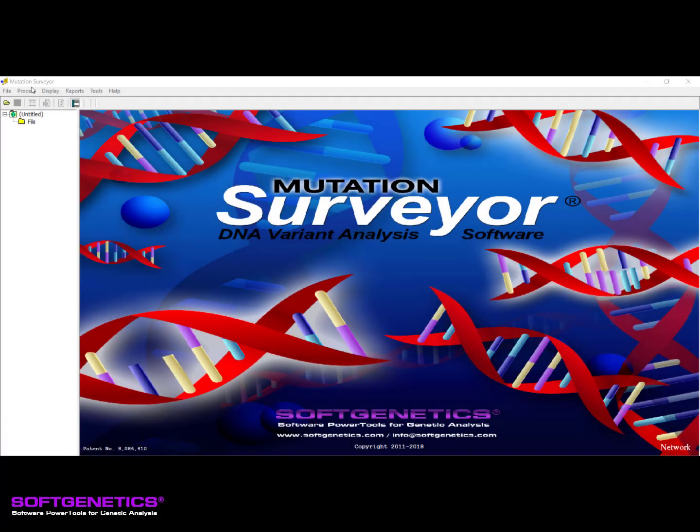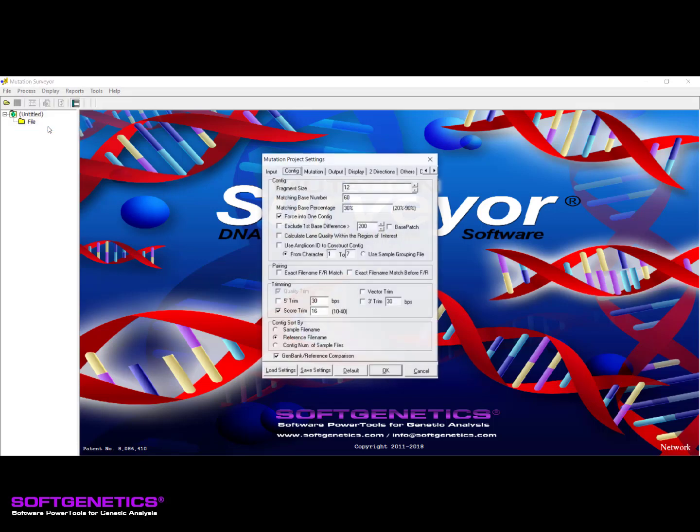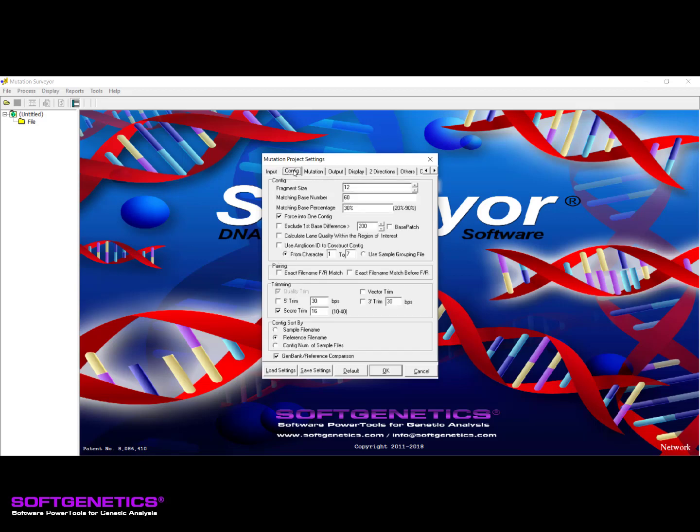We can start by taking a look at the mutation project settings located under the Process menu. The settings are categorized into specific tabs that allow for easy navigation. To the far left is the Input tab, which includes settings that tell the software how to read the trace files you load into the project. Next, the Contig tab provides settings to help group your samples into appropriate contigs, correctly pair overlapping forward and reverse directional trace files, and to adjust the boundaries of the comparison region.